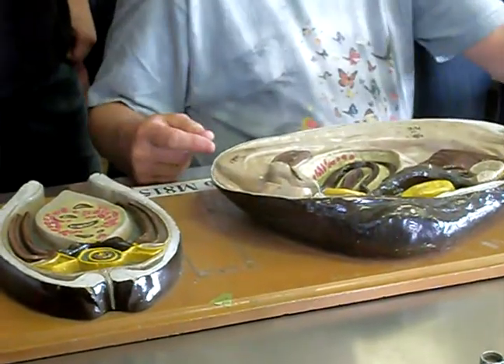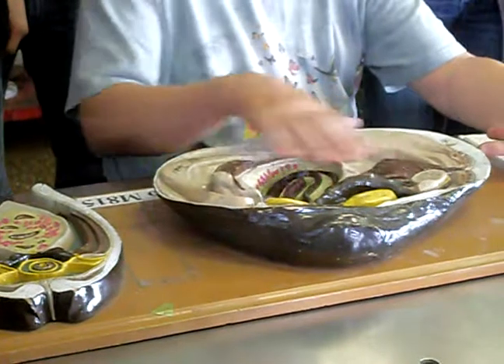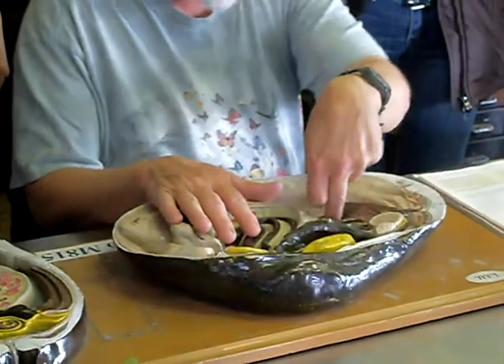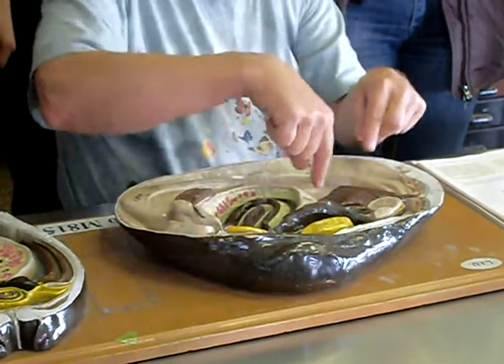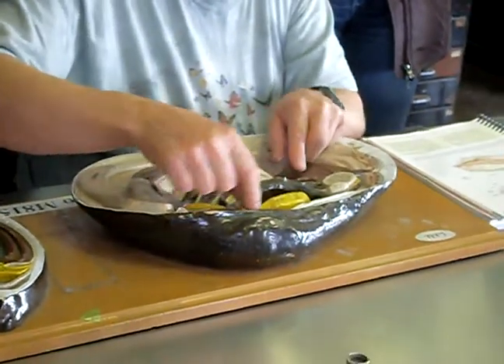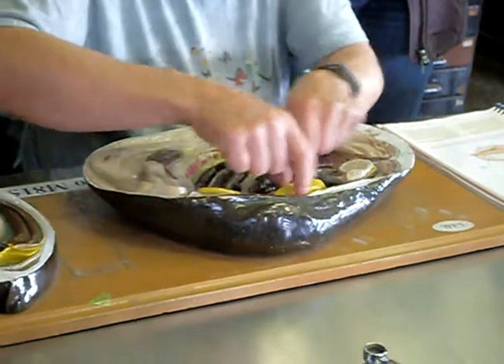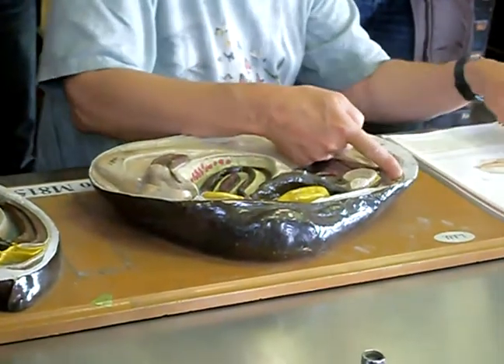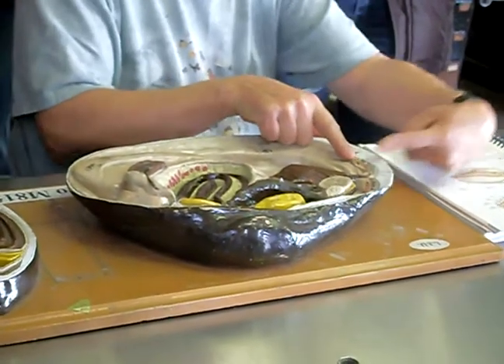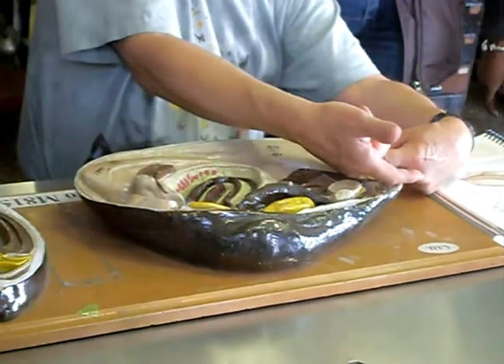The beating of the cilia on the gills brings water in here that goes down through the gills, through the little holes in the gills, comes out of the top of the gills in this chamber, and then the water goes out through the excurrent siphon, which is dorsal. The incurrent siphon is ventral, so the water goes in here and the water goes out there.